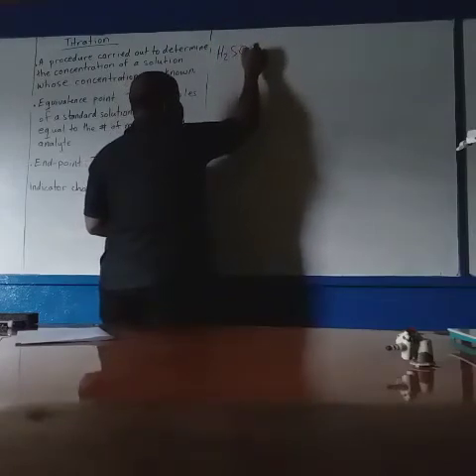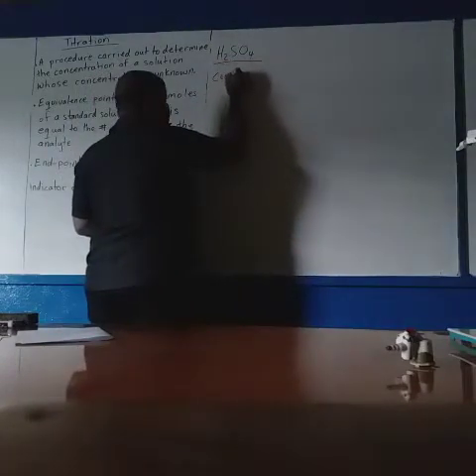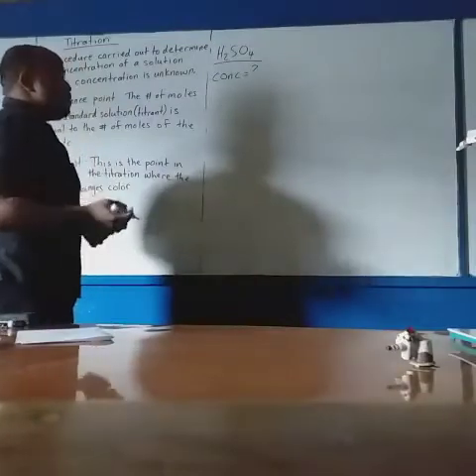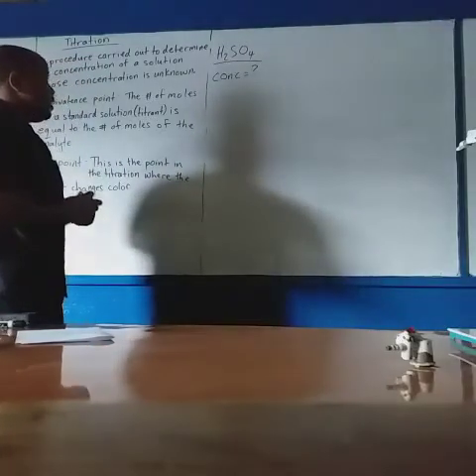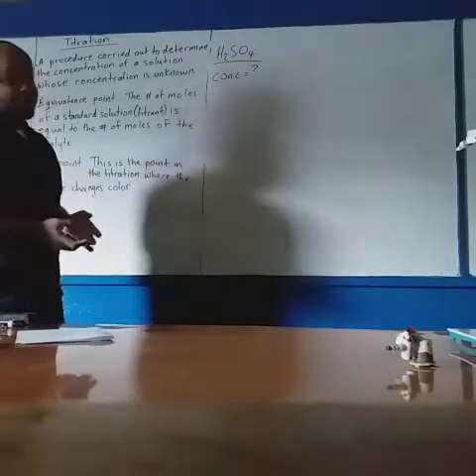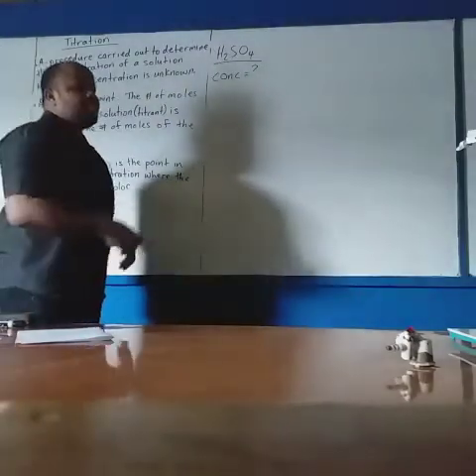So you have a solution of sulfuric acid and its concentration is unknown. You do not know the concentration of sulfuric acid, and you are asked to determine it. So the first thing we need is a standard solution. Remember, a standard solution is one whose concentration is known.